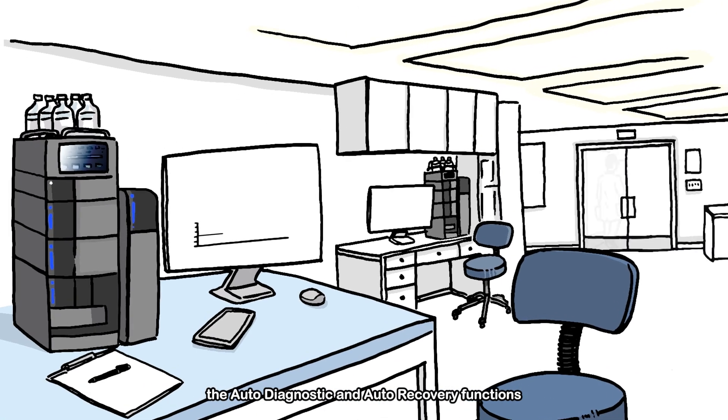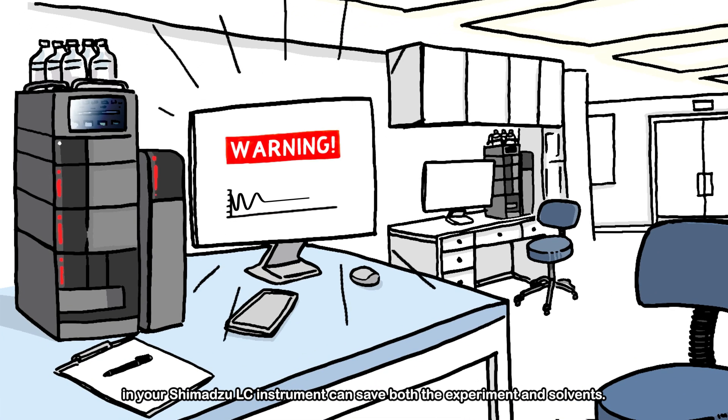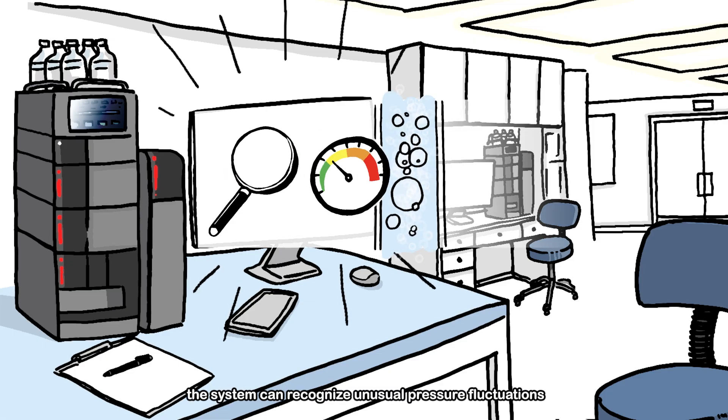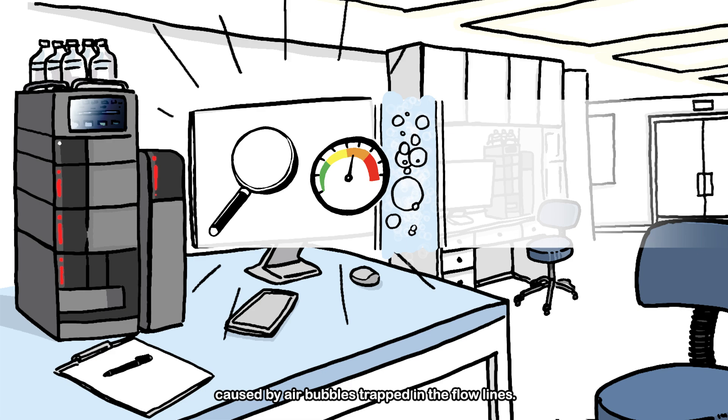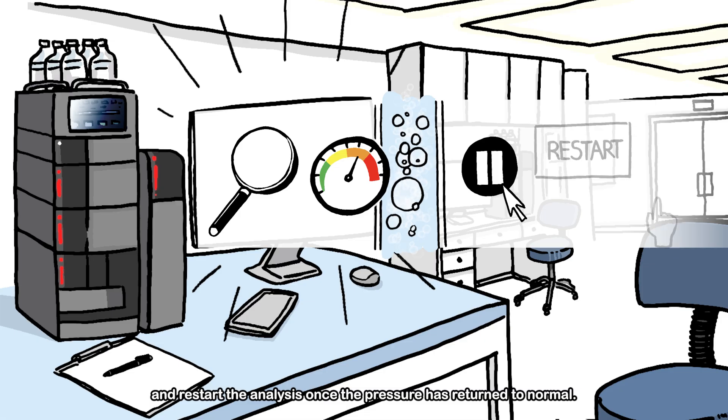the auto-diagnostic and auto-recovery functions in your Shimadzu LC instrument can save both the experiment and solvents. With rapid and reliable anomaly detection, the system can recognize unusual pressure fluctuations caused by air bubbles trapped in the flow lines. It will then automatically pause the run, purge the flow path, and restart the analysis once the pressure has returned to normal.